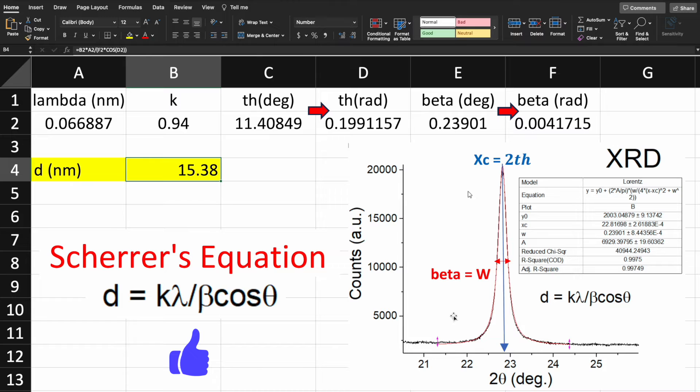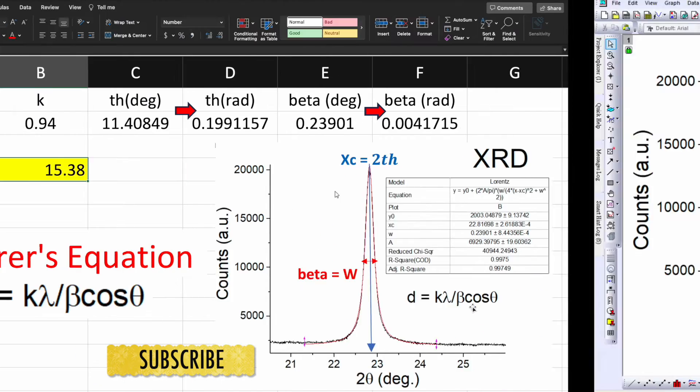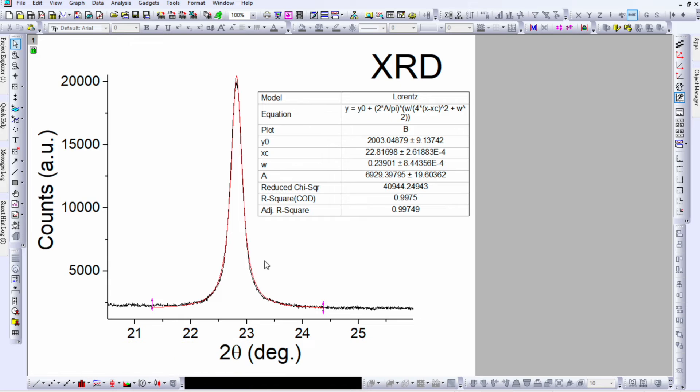First, get your XRD data and choose the most intense x-ray peak. In this case I have used Origin software to perform the peak fitting, where the black line shows the experimental data and the red line is the fitted curve.